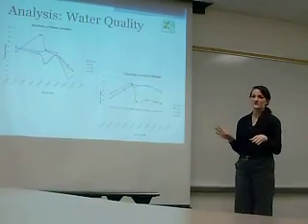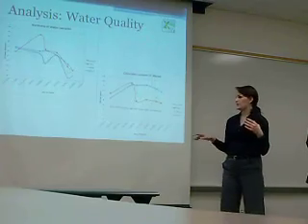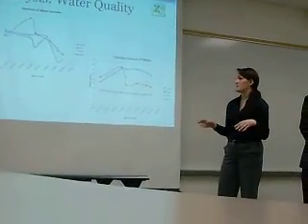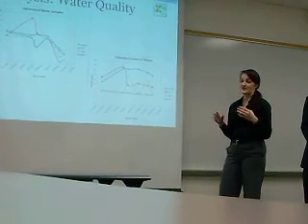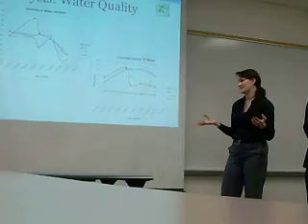And here we have the hardness of the water samples and the chloride content of the water samples over time. Again, we were just looking for anything, looking for any kind of pattern that indicated a relationship. Most of what we drew from this, though, is that the data varies a lot, and that happens with data that you take straight from nature.